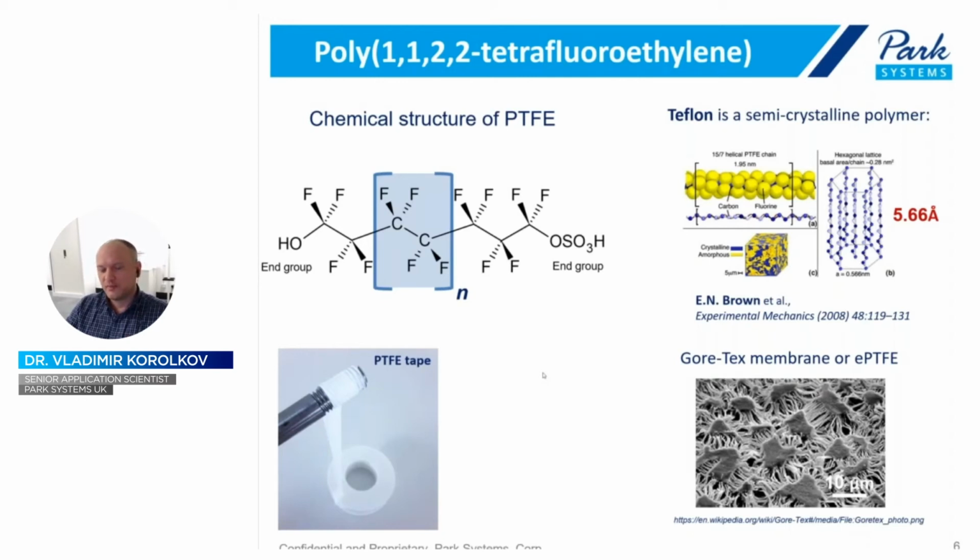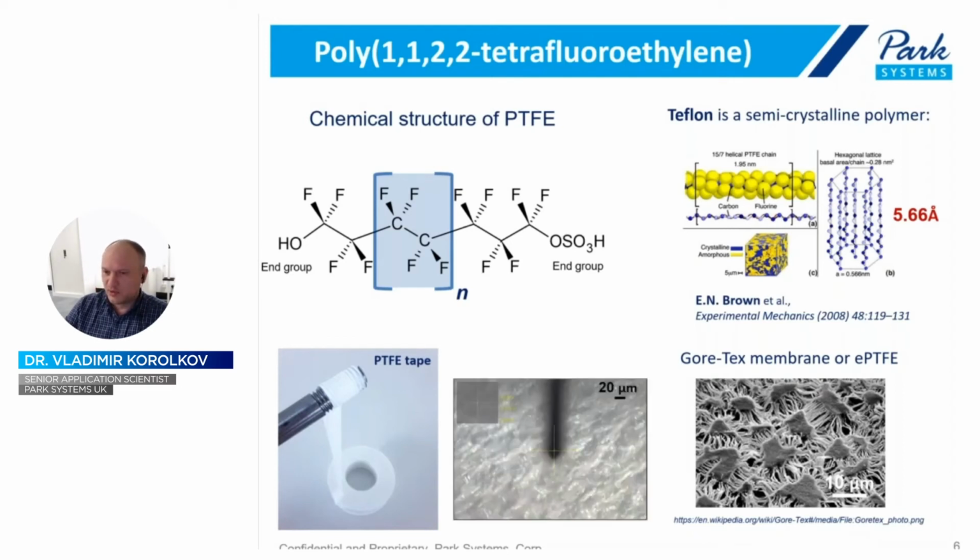If you have access to an atomic force microscope, I do suggest you take a piece of Teflon tape and give it a go. If you're using a Park Systems AFM, drop us an email if you want to learn or have some questions or problems imaging it. We will help you with that. But it's really good fun taking a piece of polymer that you can buy in the supermarket and actually seeing molecules on that polymer. Okay, well, let's go to molecules.